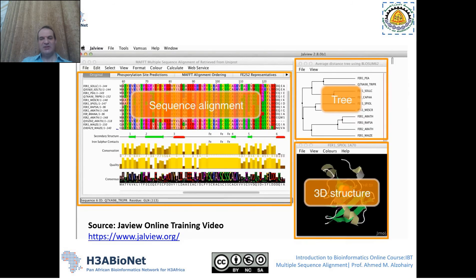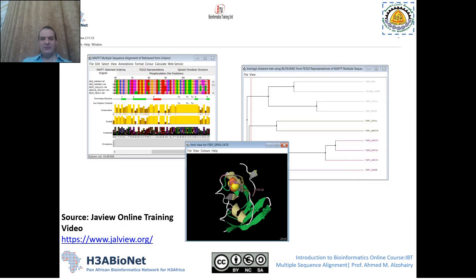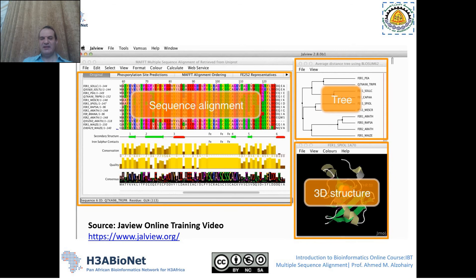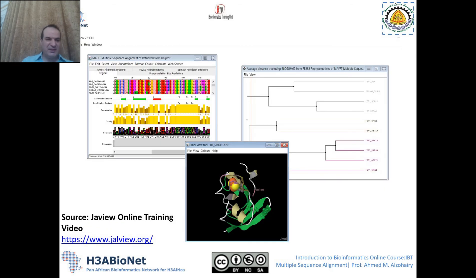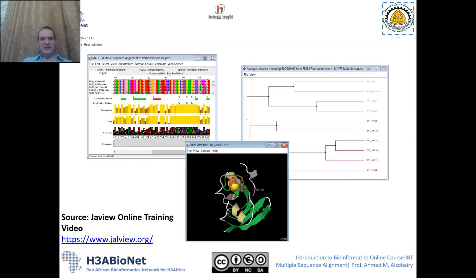The Jalview desktop has three main windows: the first is the sequence alignment window, the second is a tree window, and the third is a 3D structure window. This is the latest version, 2.11.1, which came out about two months ago, and it also has these three main windows. When you start up Jalview, an example will pop up so you can see the different features and useful tools available.